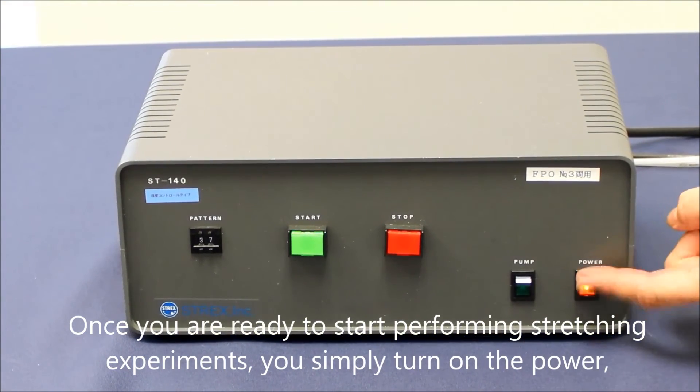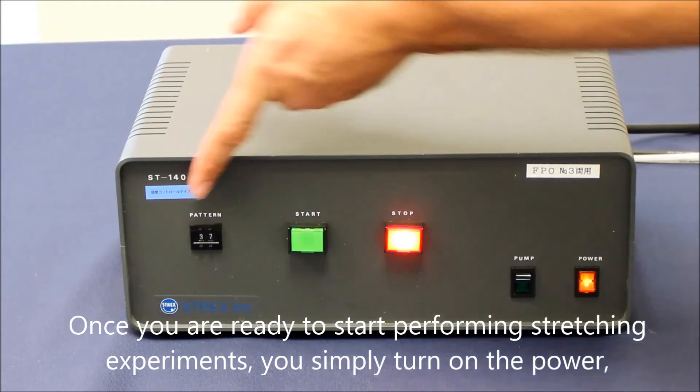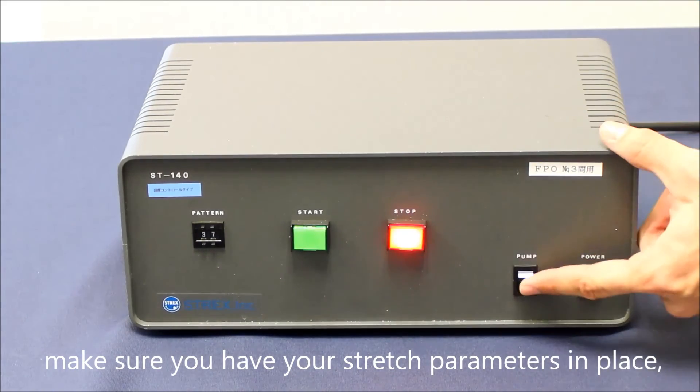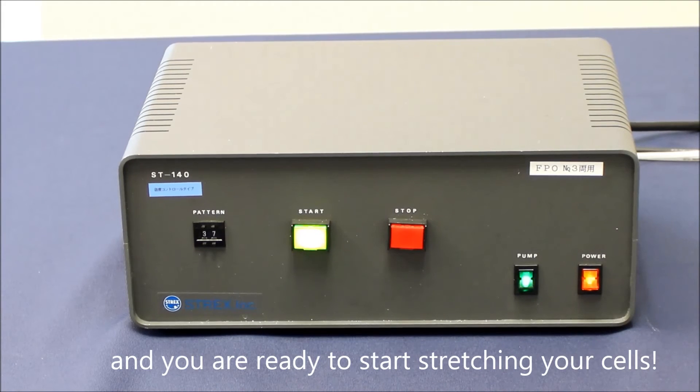Once you are ready to start performing stretching experiments, you simply turn on the power. Make sure you have your stretch parameters in place. Turn on the water pump if stretching for more than 20 minutes, and you are ready to start stretching your cells.